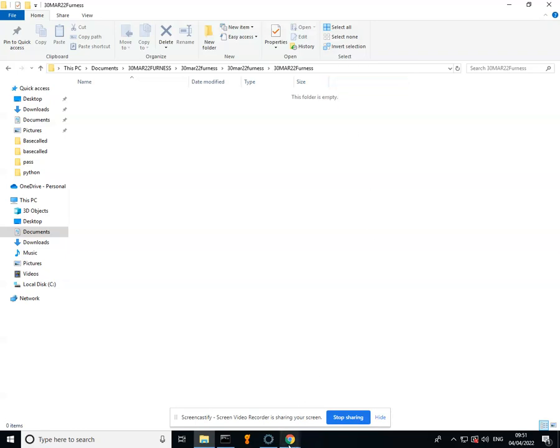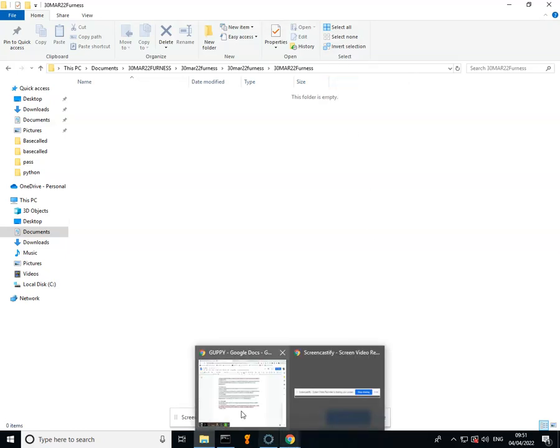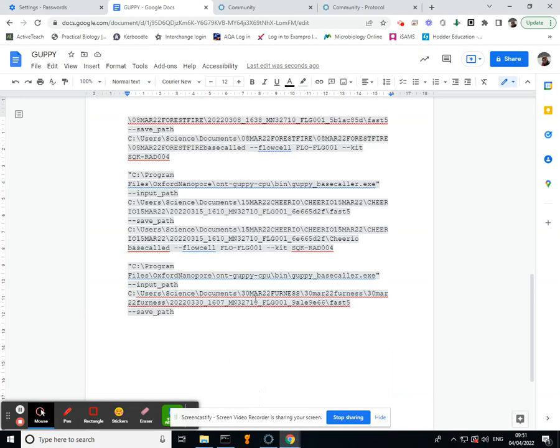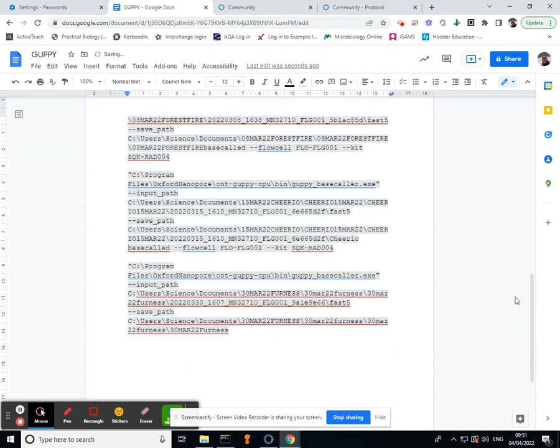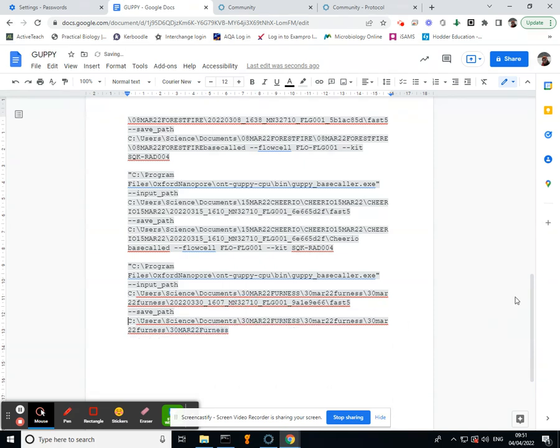And again, open it, then do your copy as text and paste. Make sure that you've only got that one space—a little self-check.